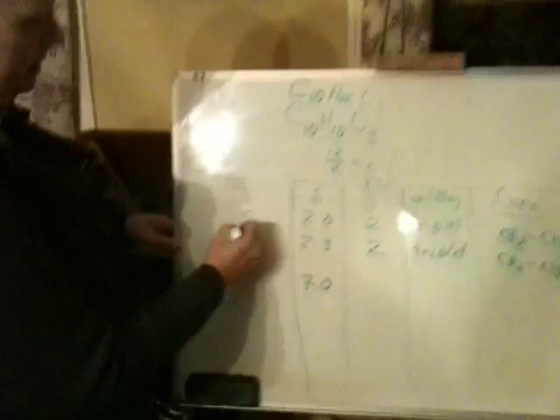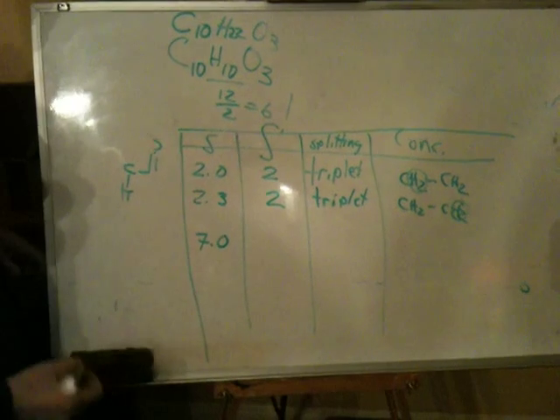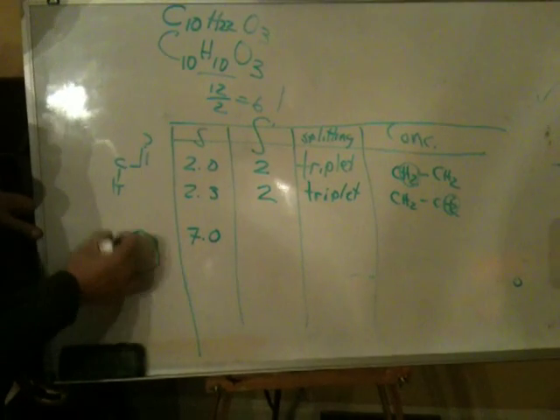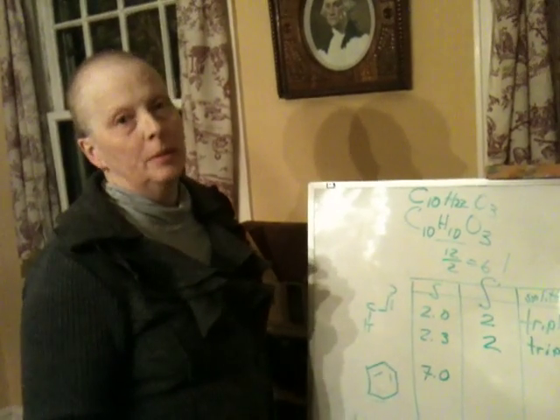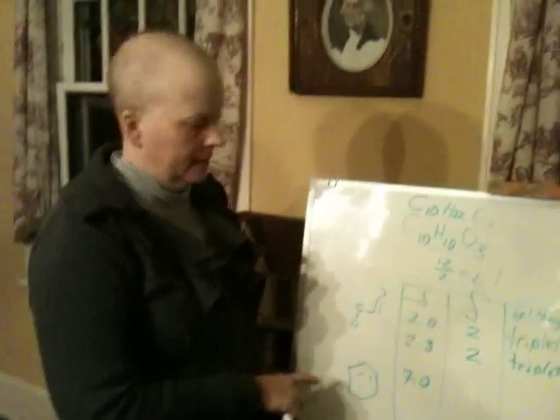All right, so then we get down around 7. What does 7 say to you about shift? Now again, I said this means near a double bond of some kind. This is saying aromatic. It should just be screaming at you aromatic. And again, the most prevalent aromatic ring is a benzene ring. That doesn't mean it's always a benzene ring, but most of the time it will be. And you don't want to go to something more exotic until you've exhausted this idea.